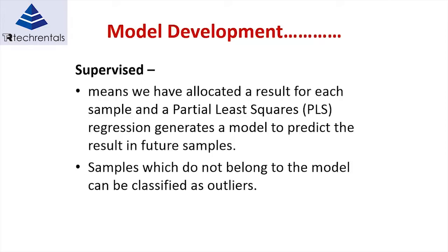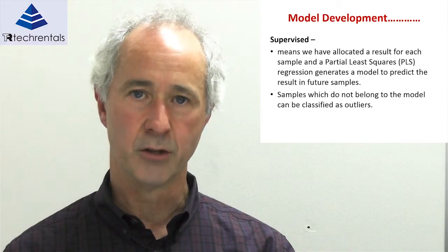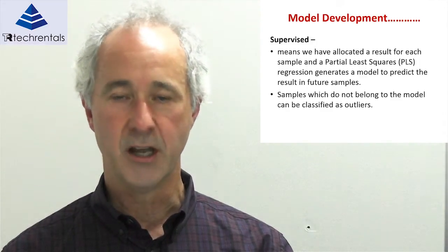So if, for instance, the material considerably changes, then you can also easily determine that as well. It's also often very important to do that because you need to know how well your sample is fitting to your model, to have some confidence level that you're predicting accurately. So we have a few different ways of measuring the outliers in real time as well.